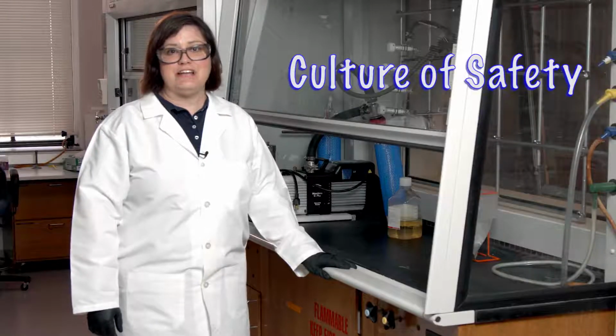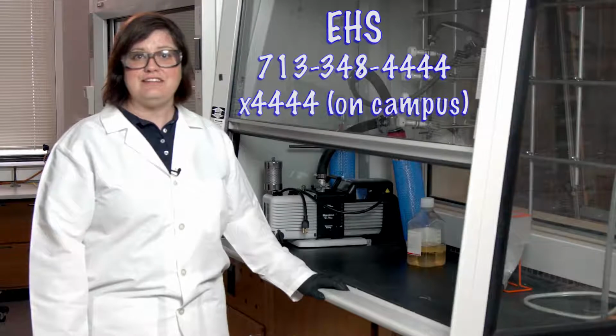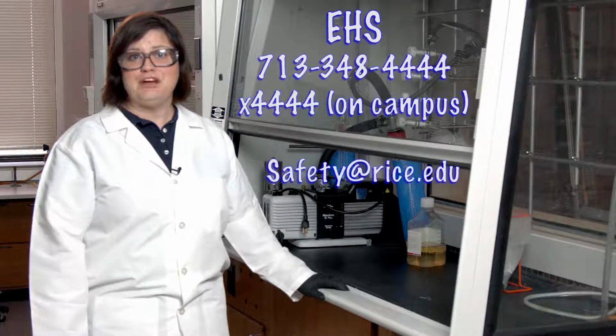At Rice, we want to develop a culture of safety. This means we think about safety before an accident occurs. As part of developing that culture, Environmental Health and Safety is available to answer any safety questions or concerns. We can be reached at 713-348-4444 or by dialing 4444 from any on-campus phone. We can also be reached by email at safety@rice.edu.